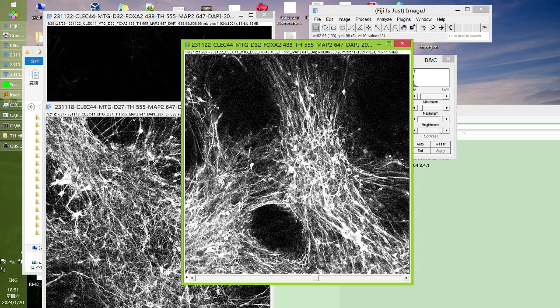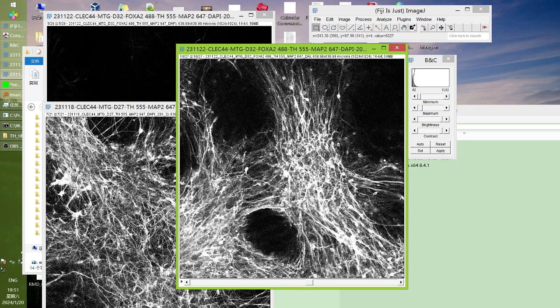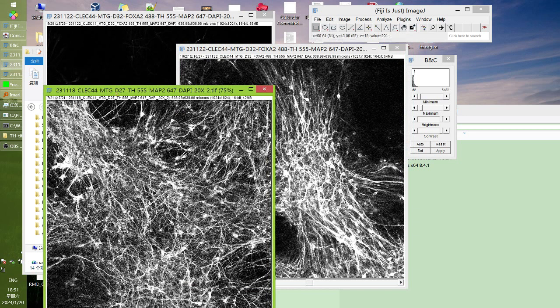Okay, so I will layer them as a single stack, and I think this is also important because we cannot predict in the next similar experiment how many slices we will acquire. If in the next experiment we have 40 or 45, it will not be as compatible along the time series, because we will do more work to make the slice numbers equal. It is not necessary. So it just makes them as a huge stack.